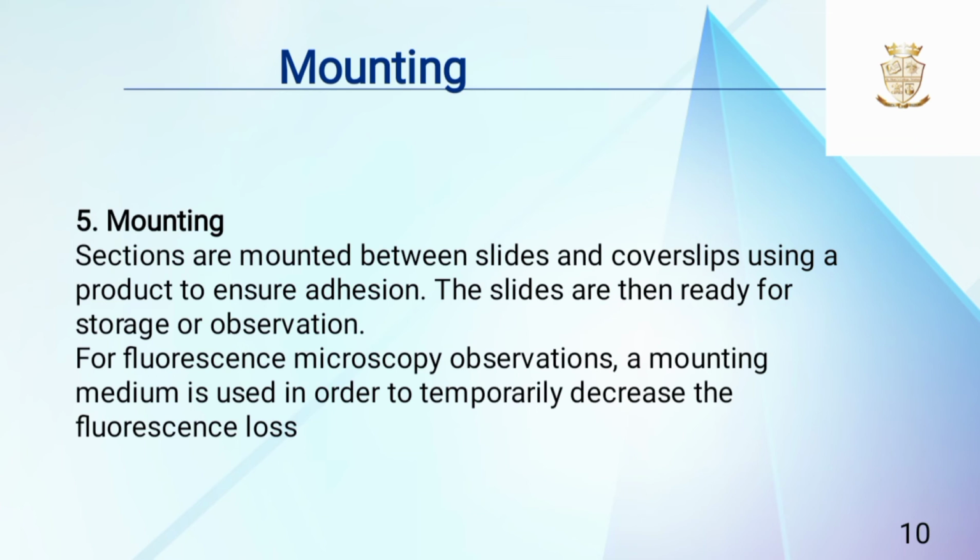Sections are mounted between slide and cover slip using a product to ensure adhesion. The slides are then ready for storage or observation. For fluorescence microscopic observation, a mounting medium is used in order to temporarily decrease the fluorescence loss.